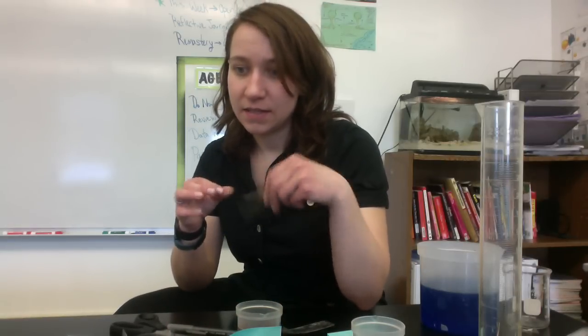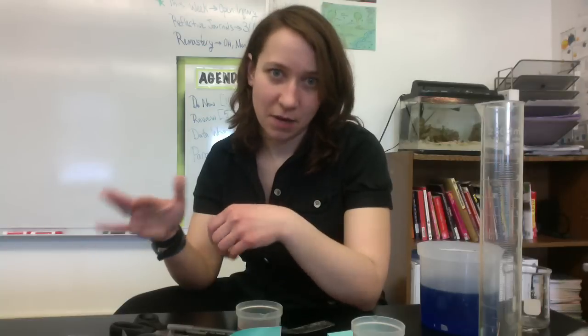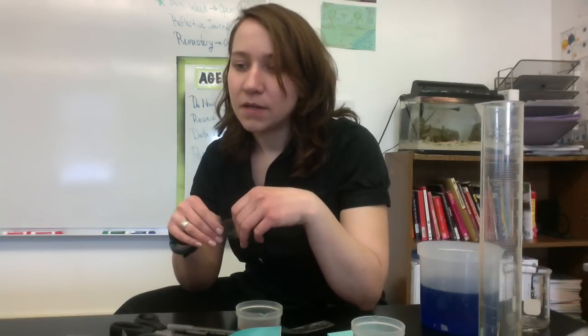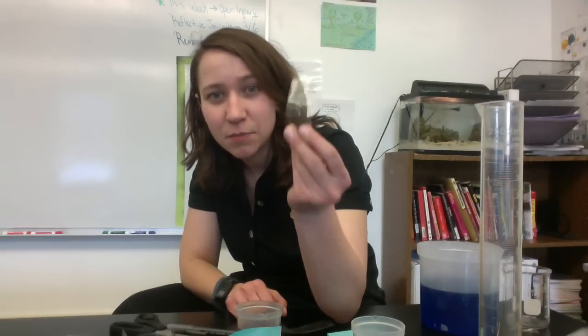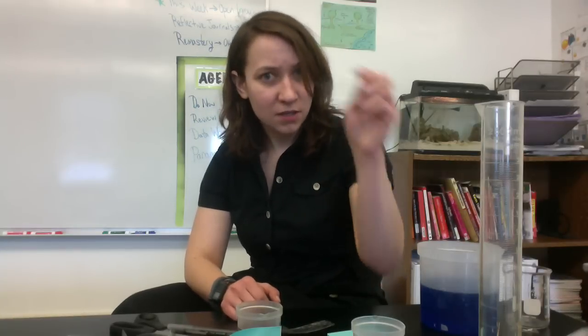The first thing we're going to do is step one: gather some cups — you guys know how to do that. Step two: creating an artificial cell with dialysis tubing. So this is dialysis tubing here. There's going to be some pre-cut strips. What I want you guys to do is take it back and get it wet.